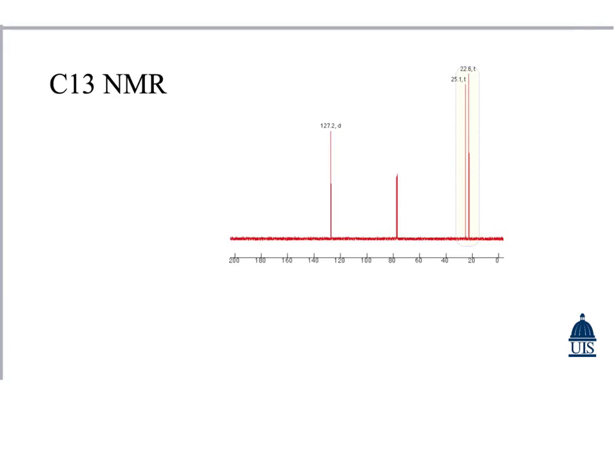Now that we have a structure in mind of a 6-member ring with a double bond between carbon and carbon, we can now analyze carbon 13 NMR. We're going to add the hydrogens to our structure and compare all the different carbon environments that the structure has.